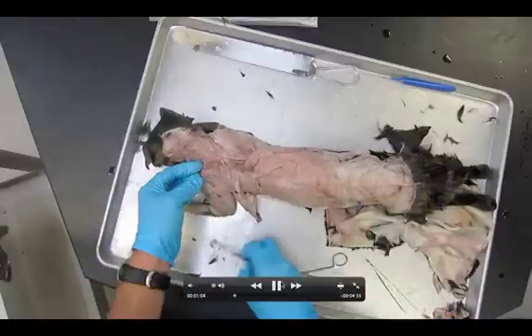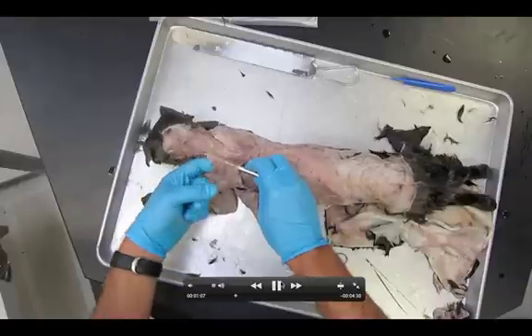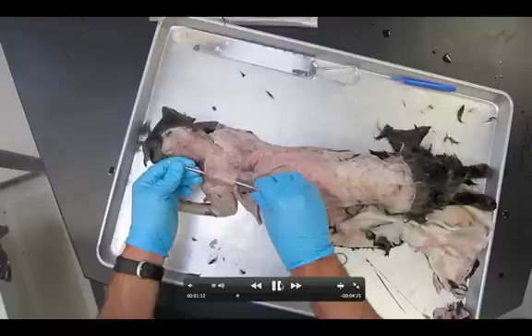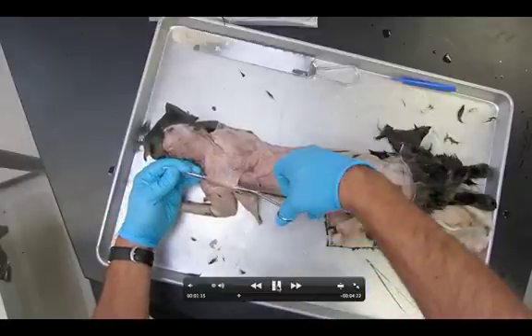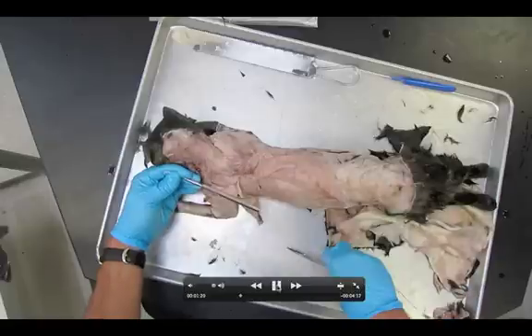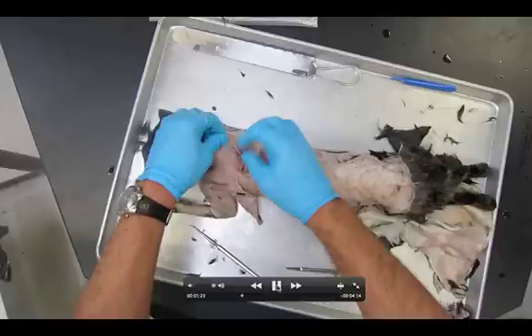We're going to cut the acromiotrapezius now. One important thing: make absolutely sure that the levator scapulae ventralis running right about here does not get cut. We only want to cut the acromiotrapezius, so be really careful. This is why it pays off to have dissection one completely finished before starting dissection two. We're going to cut right in the middle, using the probe as a guide, and flip it up.